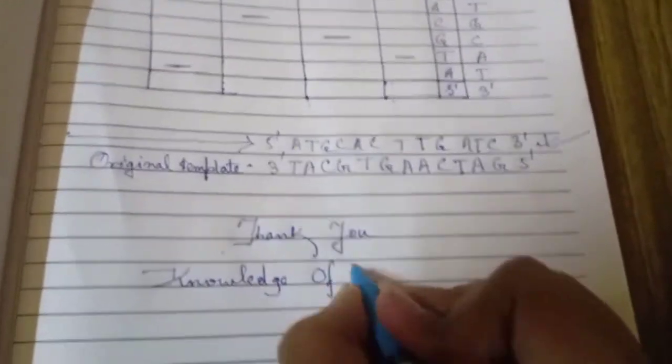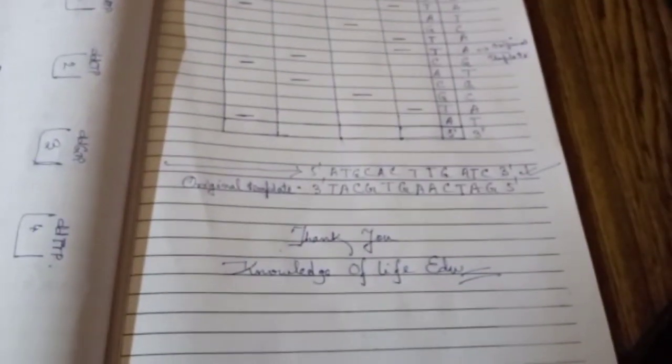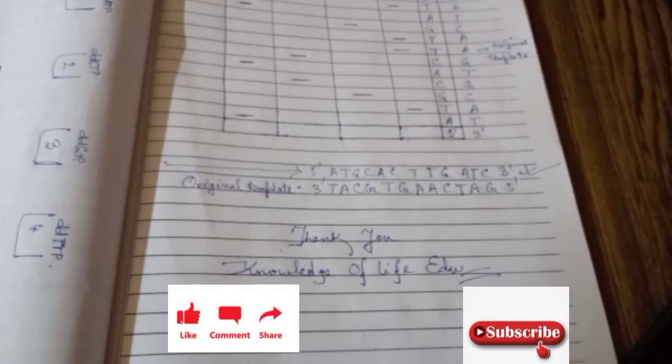If we see that, the basic concept is guanine pairs with cytosine and adenine pairs with thymine. Hope this video will help you to understand Sanger sequencing.